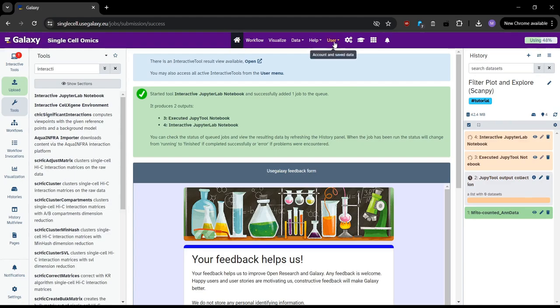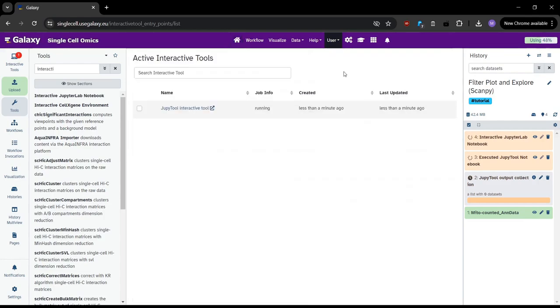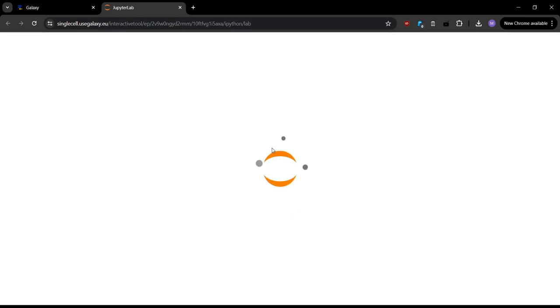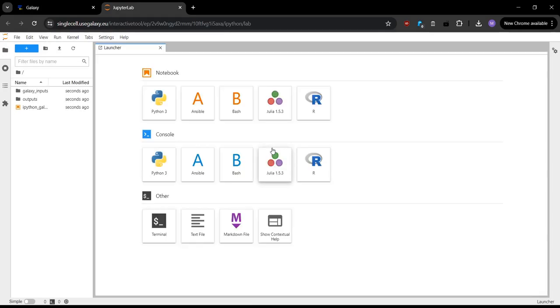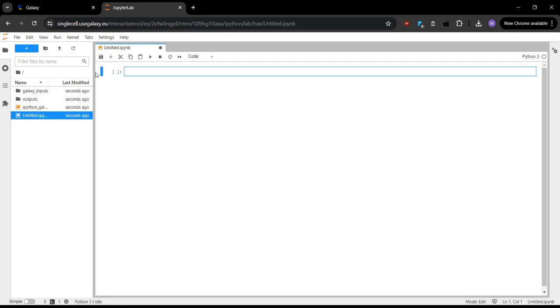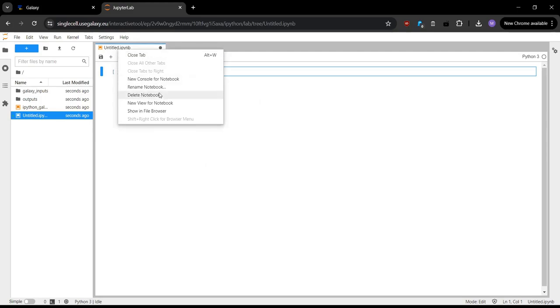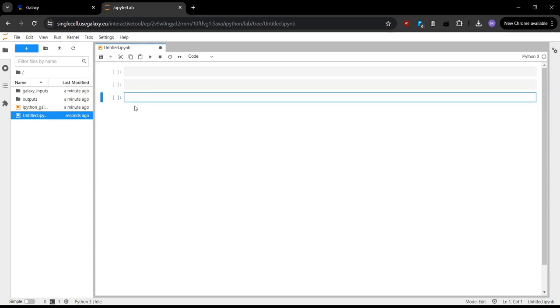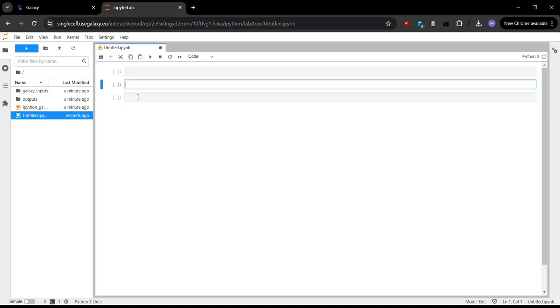So now we can see it's orange, so it's now running. So we can access JupyterLab by going up to user. Active interactive tools, and then we can have our list of our interactive tools. So we can see our JupyterLab here. The job info shows it's running, and it was created less than a minute ago, so this is the correct one. So we can go ahead and click on this link. Now we'll open up a new tab that will launch JupyterLab for us. Now we just wait for that to load. So we have JupyterLab here. We can create a new notebook. Under the notebook section, we can click on Python 3. That will generate a new notebook for us. We can go up here, and we can rename the name of the notebook. We have our code cells. We can click on this button to create new code cells.